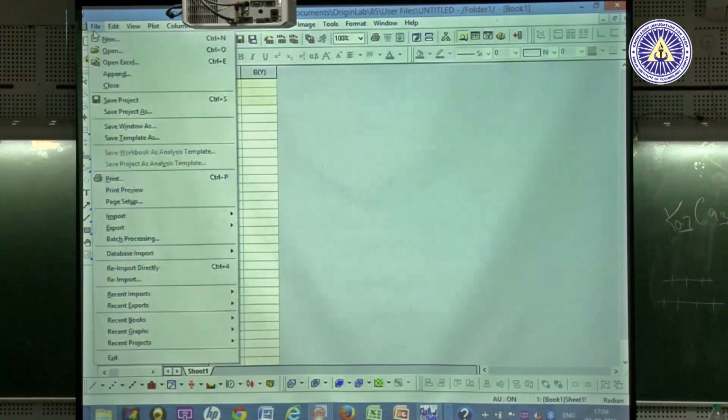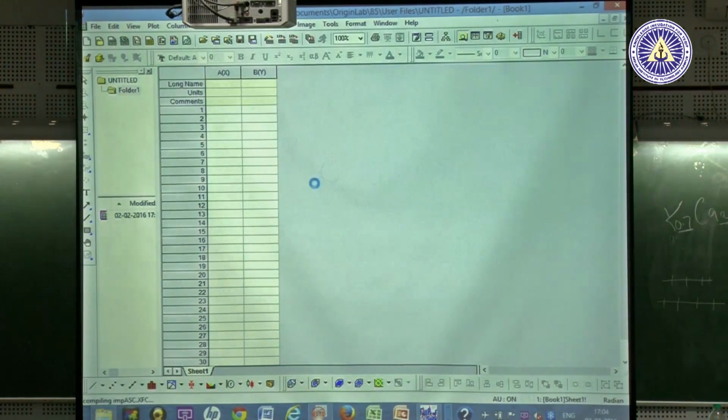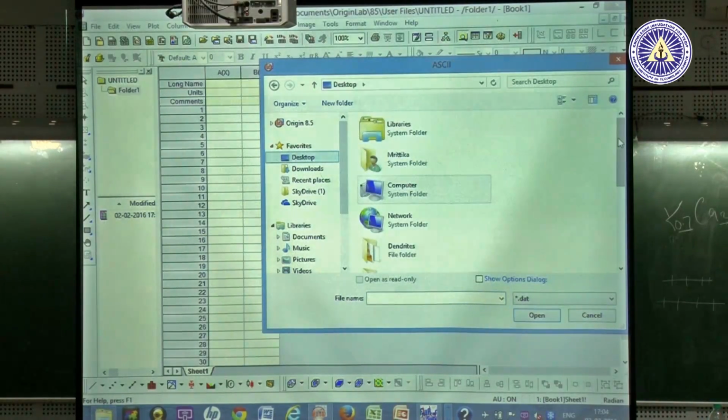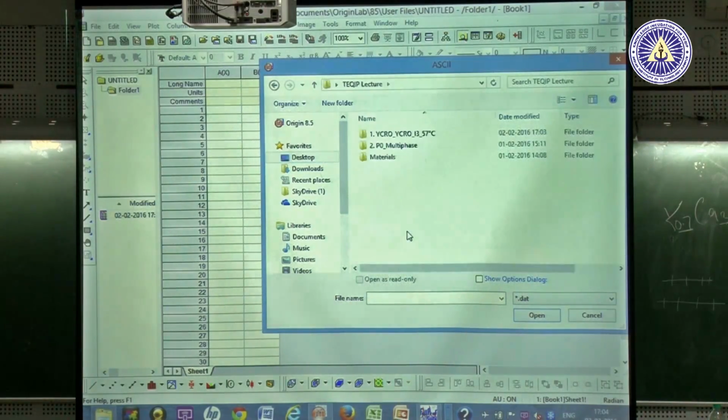Then just open that file here. Because most of the time the problem is, you did the refinement, but you do not know how to extract the data.